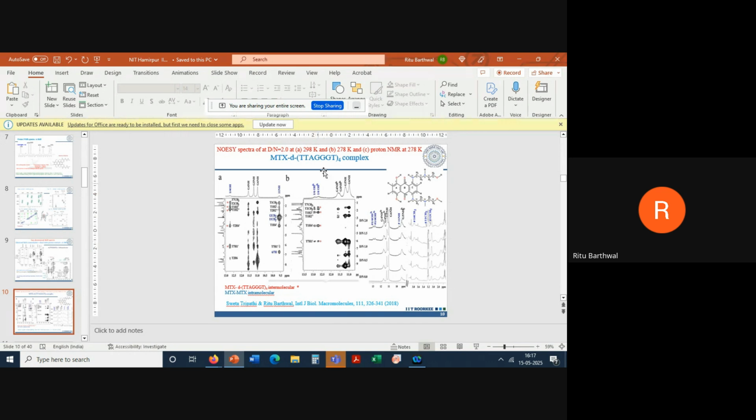In this way, this is the NMR spectra of the complex. So this is my G quadruplex, and this is the ligand. So I have taken the spectra of the ligand, which has been added to the G quadruplex DNA. Binding has taken place. So what do we do? We take DNA, add ligand to it. We want to know whether binding has taken place or not. We will use absorption, fluorescence, circular dichroism spectra, and so on. And we will come to know from all these techniques or SPR that binding has taken place, a bound complex has been formed. We will get K equilibrium and so on.